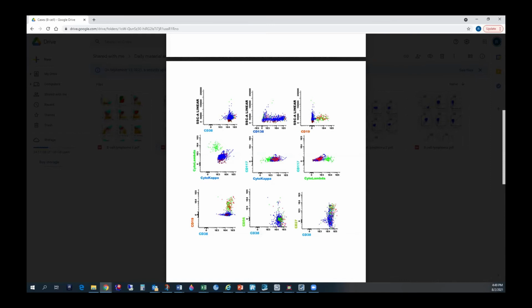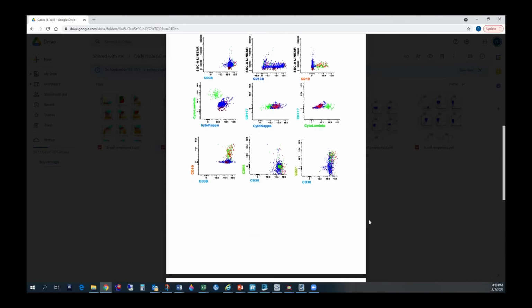And this is interesting, because normal plasma cells will show CD27 expression. So they are on the positive side, and you'll see a little bit of normal cells that are negative. So always in 56, in 200, in 117, you might see 3-4 cells going up there. That's okay, unless the majority of the cells are on the positive side, they are not worrisome. Same way, the majority of the normal cells are positive for 27, just 3-4 are sitting in the negative side. That's okay, but the majority of your abnormal cells are negative for 27. So that is reassuring that it is abnormal.